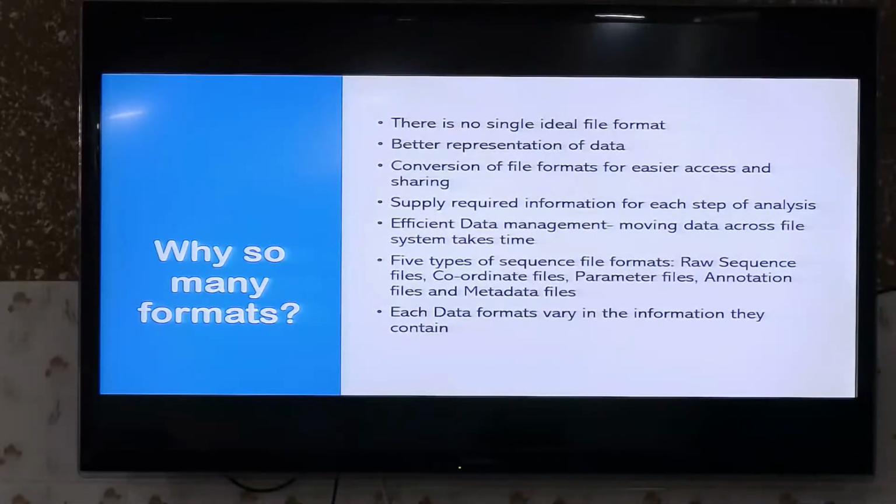Because we know what the FastQ file contains and what the VCF file contains. So for that, one should have in-depth knowledge. I'm not saying that you must know in which line it tells which meaning, but I'm saying that you must have an idea of the overall structure of each file type which is major in this analysis.